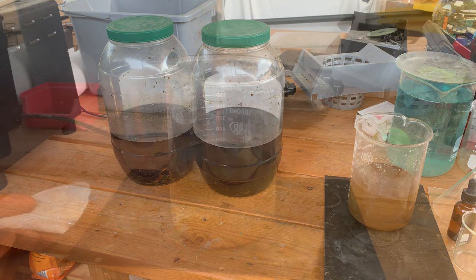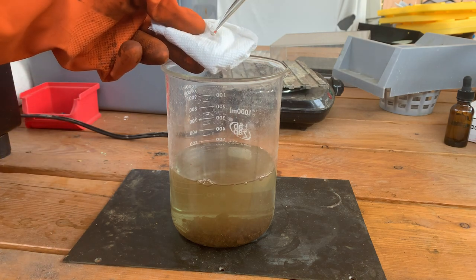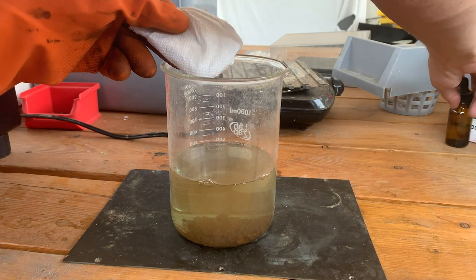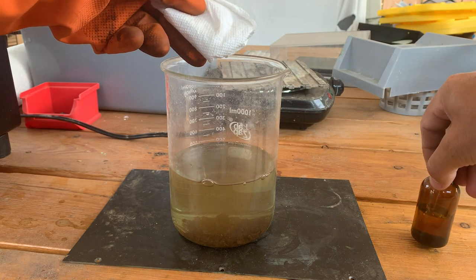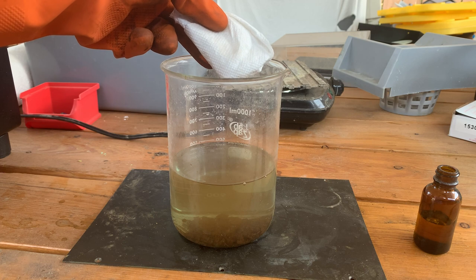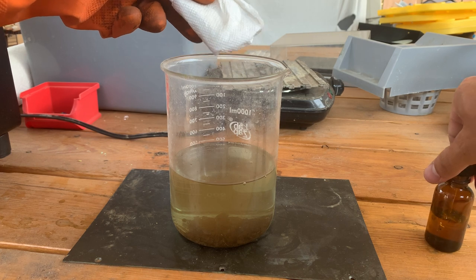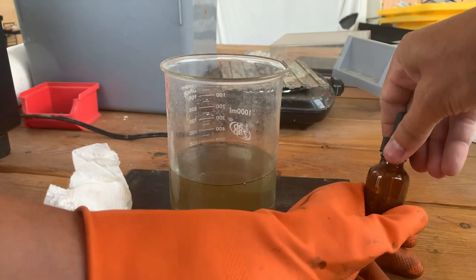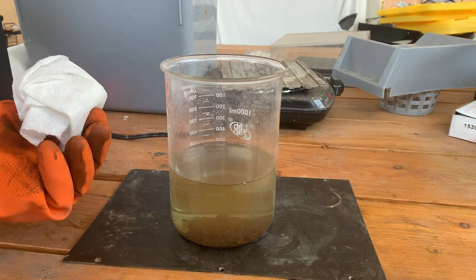It's been about an hour and the liquid is clear for the most part. There's some brown floating still, but we're going to do a quick stannous chloride test on the liquid. It is quite clear, so I am convinced that we don't have any gold in solution anymore. Let's go ahead and filter this and we'll see if we can make a button out of it.